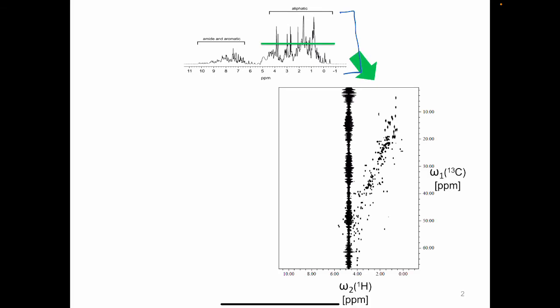So that is what is done in the 2D NMR spectrum here. And what you are able to see is that you are correlating 13C spins with 1H, and in the indirect dimension, we will call it the F1 dimension. The direct dimension is called the F2 dimension.